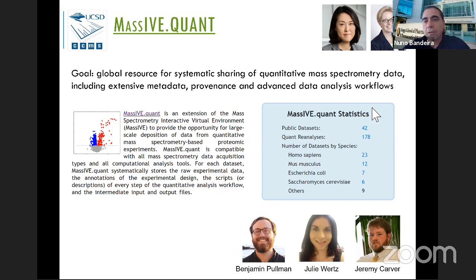But then to know the experimental design and the sample metadata, that indeed has to be submitted with the data set, the description, or it can be added later. So some of the data sets here in MassIVE.quant were originally submitted without any metadata, but we were able to go back to the paper, figure out what that metadata was, add it to the data set, and now use it for the new analyses that are shared.